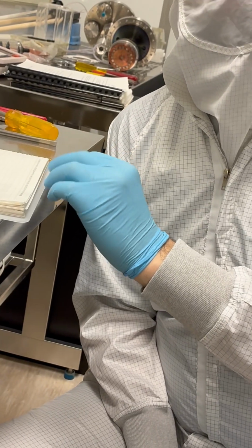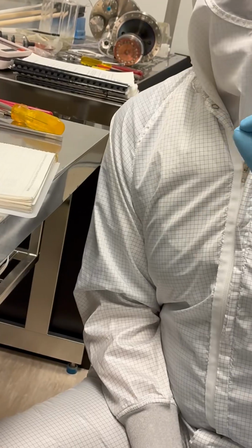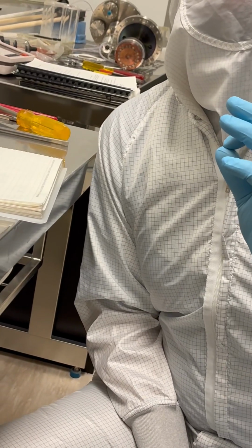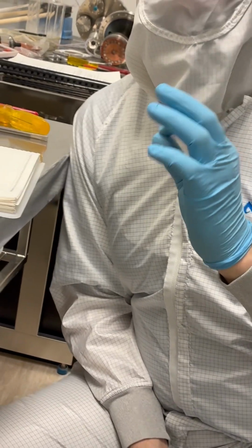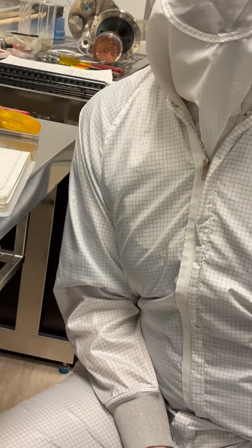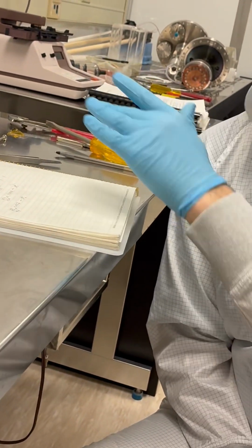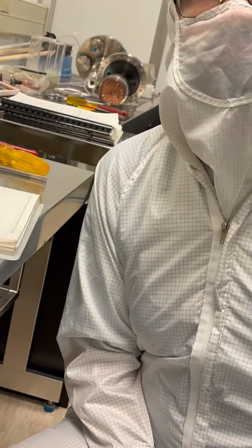You see? It's 5% off. But the actual difference run to run might be only off by 1 or 2%, right? So it would be 0.18, I'm just guessing, plus or minus 2%. But I don't know what the actual number is. It could be plus or minus 10%. You see what I'm saying?